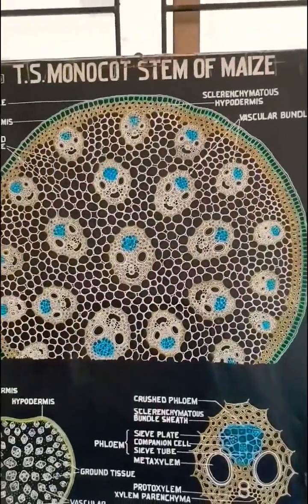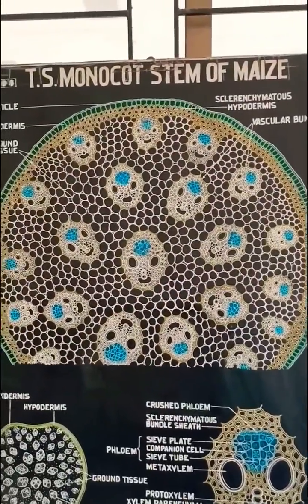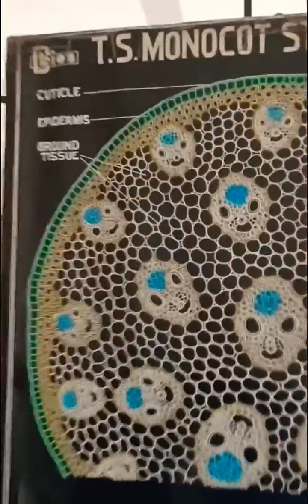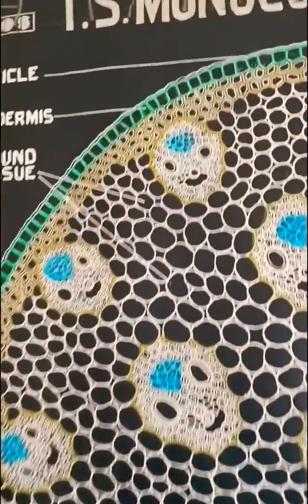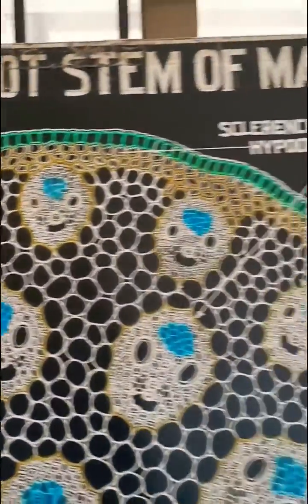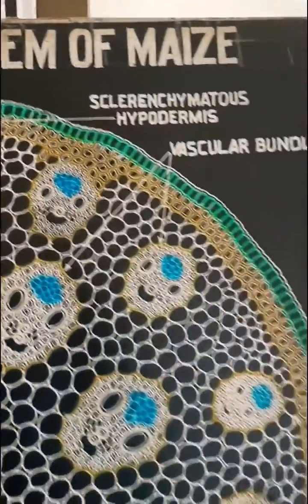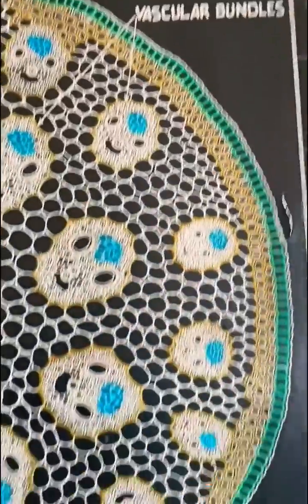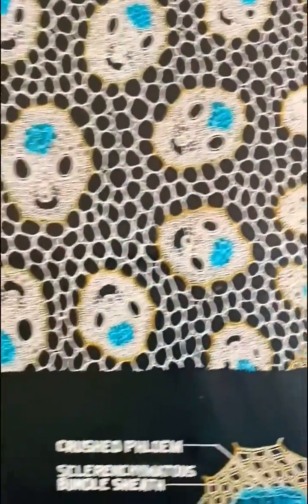Now, why is this a monocot stem? The vascular bundles are scattered. You can see — when vascular bundles are scattered, it's a monocot stem.